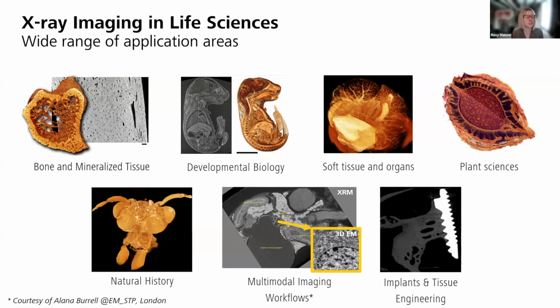The world of natural history, obviously specimens that are millions of years old, completely irreplaceable. You can't be chopping those into bits, so you need to be able to image those non-destructively. Implants and tissue engineering. How well does your implant actually integrate with the new bone when you start to implant it inside the specimen? You need to be able to look at those interfaces non-destructively, and X-ray technology offers advantages for that. And also, again, as Liz alluded to, the idea of using an X-ray tool as part of a multimodal imaging workflow. So as a step in a multimodal imaging workflow, we have an increasing number of people who are using X-ray technology for that purpose.